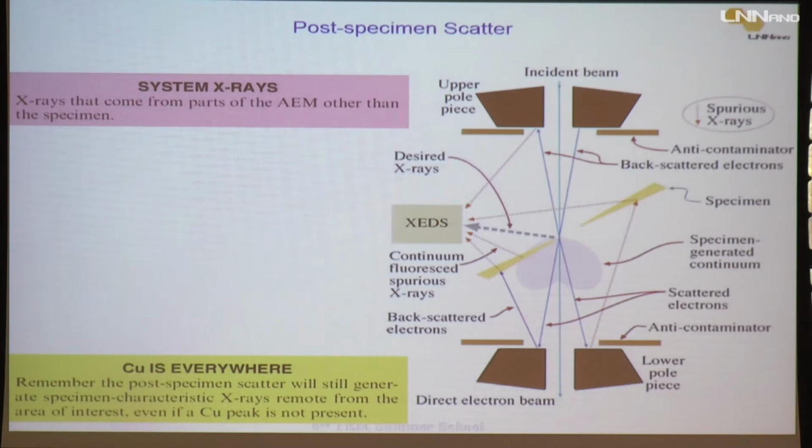Well, EDX is very, very problematic. You have many problems with the artifacts, with spurious signals, and so on. But as I said, it's my preferred technique. It's very simple to use, okay? It's very reliable. All these artifacts were well described. Well, when you know all this, you can use the best of the technique.